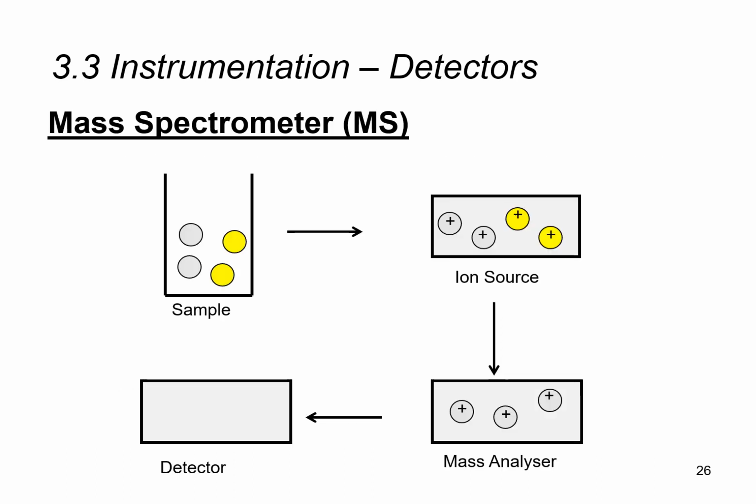Now the last detector that we'll be talking about is a mass spectrometer. The mass spectrometer essentially detects gaseous molecules or gaseous ions based on the molecular weight or the molecular mass of these ions. So in the first diagram, we have a sample with your various gaseous molecules. As they pass through the mass spectrometer, the first thing it does is convert these gaseous molecules to ions. So you see a whole bunch of positively charged ions.